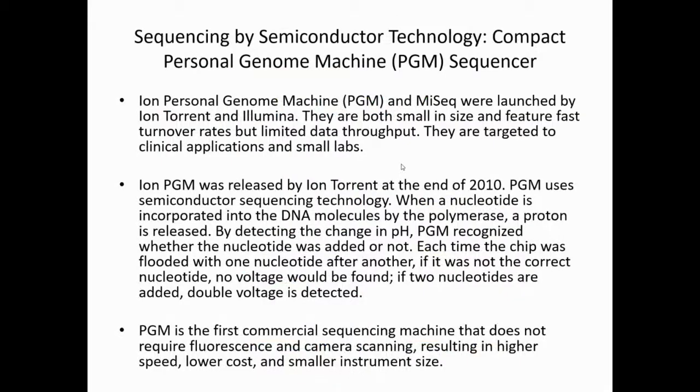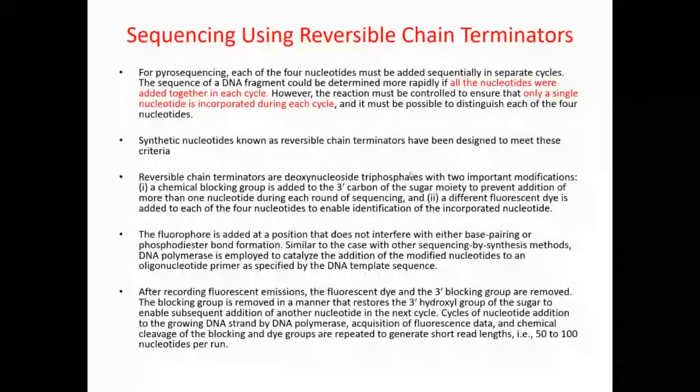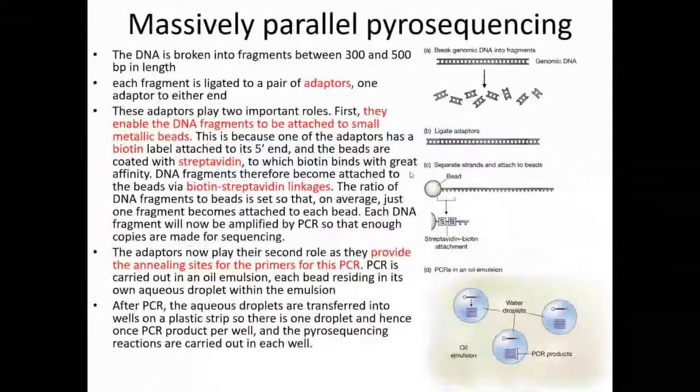And then for the sequencing by semiconductor technology, basically, this one is based on the effect that if we go back to the sequence principle here.